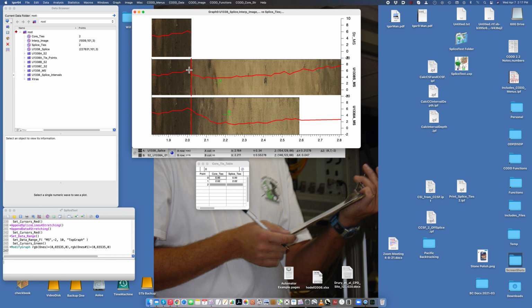You know, the data are coming down here and then sort of flattening out. It's coming down here and flattening out. So that's all right. Or maybe you want to be really picky. Let's pick this little bump there just as it comes down and sets. All right, so we want to record those stretch ties, which is Command 1.